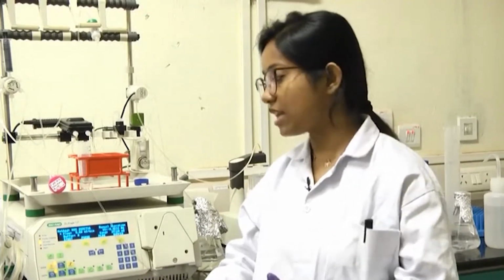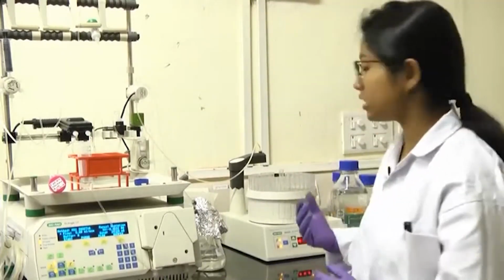It will vary depending on what kind of protein you are using and what kind of expression system you are using. Sometimes your protein might go into the inclusion body. As I mentioned, after centrifugation your protein is in the soluble fraction, and there is one part which is the insoluble inclusion body, which is basically unfolded. E. coli expresses at 37 degrees centigrade, but if you lower the temperature during expression to 16 or 20 degrees, it might not go to the inclusion body and might stay in the solution. So you have to modify the whole protocol based on your requirement and see what is best for your protein.